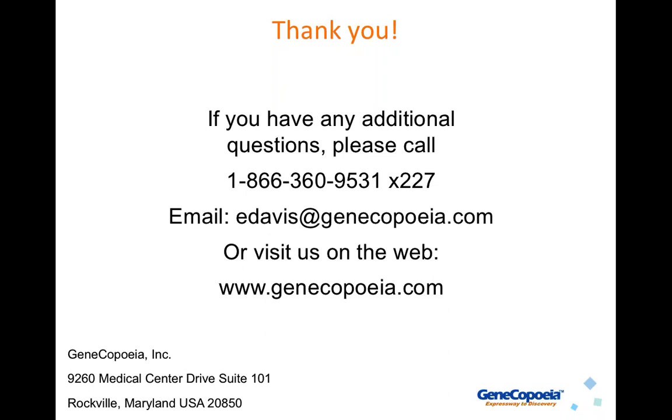Okay, so next question. In functional validation, do you need to run this test on each cell line you will be using to do editing? Well, that's a very good question. I would say you don't have to. It's not essential. You could probably just do the functional validation in one cell line, but we certainly recommend doing it in multiple cell lines if you are in fact working in multiple cell lines, because you may get different results. So yeah, I would recommend doing it in every cell line you're using.